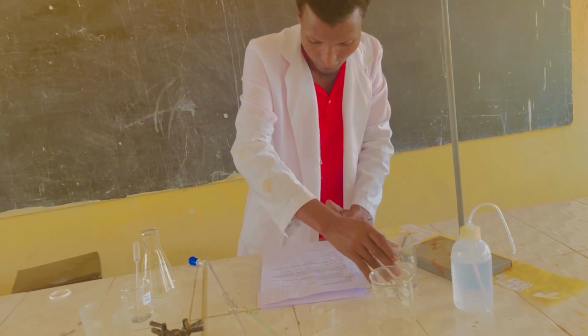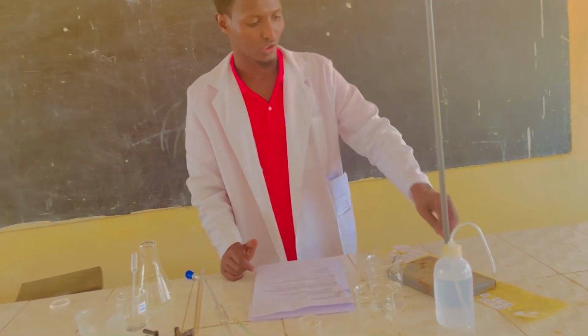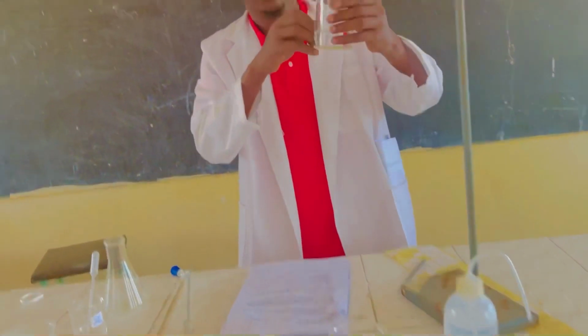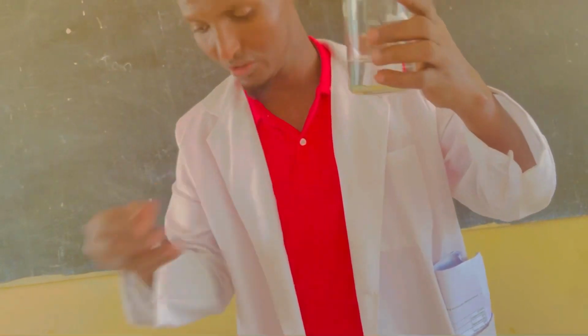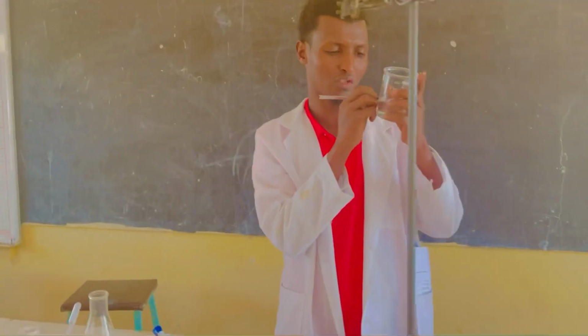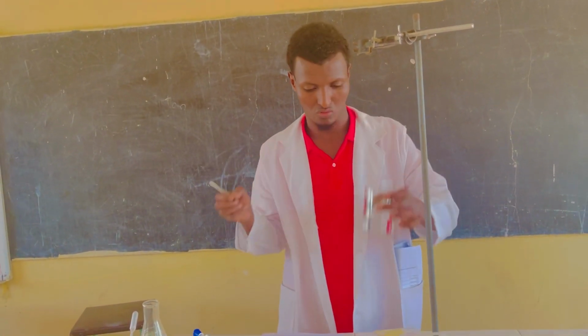After shaking, label this solution W. So this is my solution W.